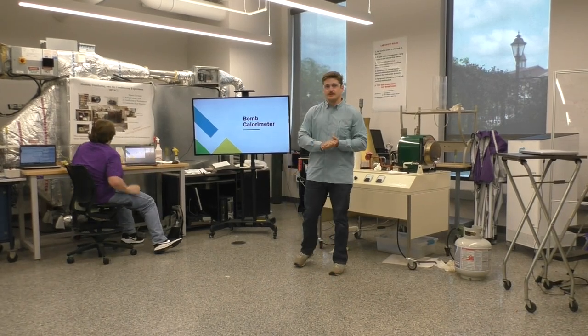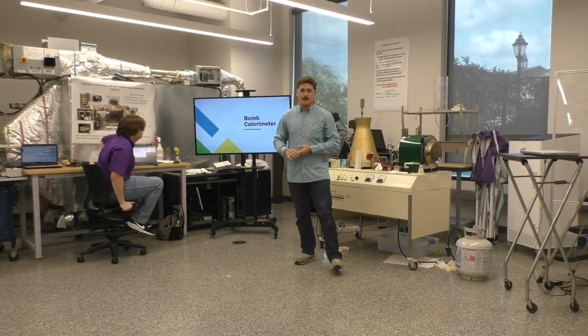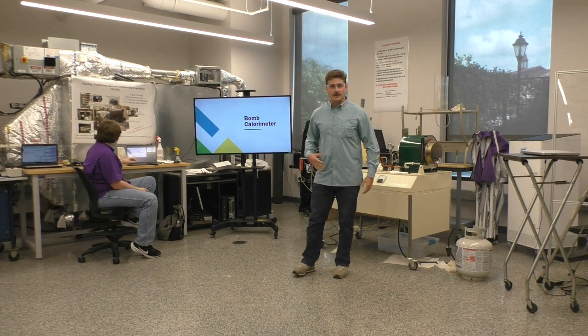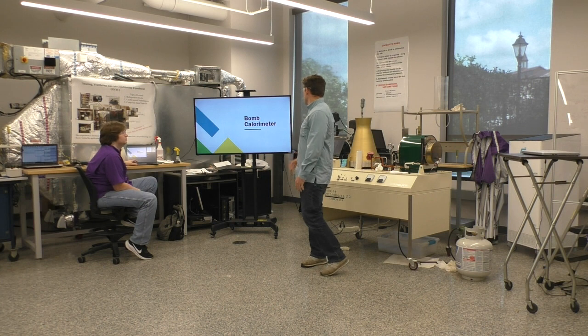My name is Rhet Wilson. This is presenting about the bomb calorimeter. We're going to learn what it does, what its use is, and how we can perform the experiment properly.